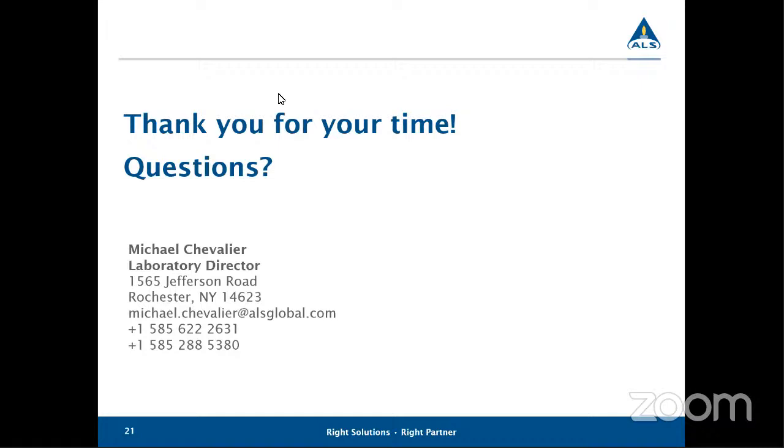David is asking, are there any QA/QC samples associated with receiving an RPP? Does anyone sample or document the water volume quality? So if you're referring to the DI water that's inside the RPPs, yes, we test every single lot that leaves the lab to make sure that it is free of any contaminant before. Yep.